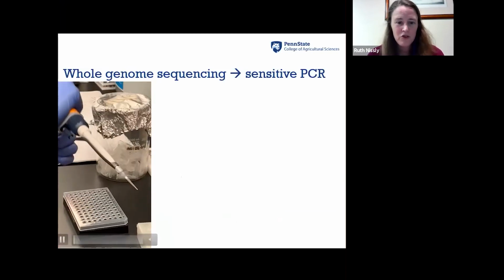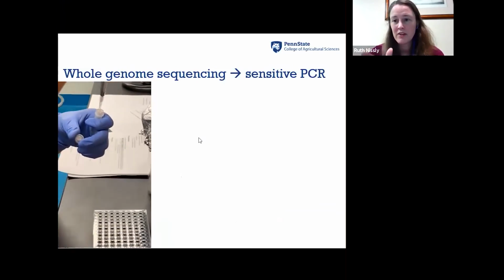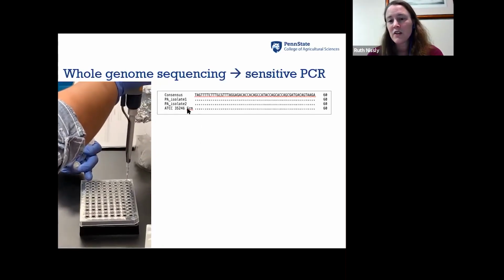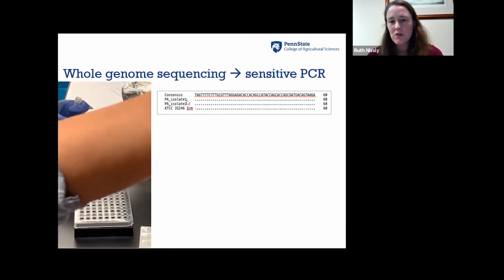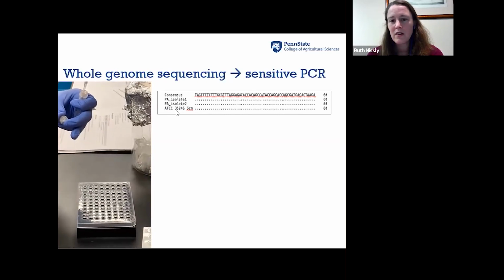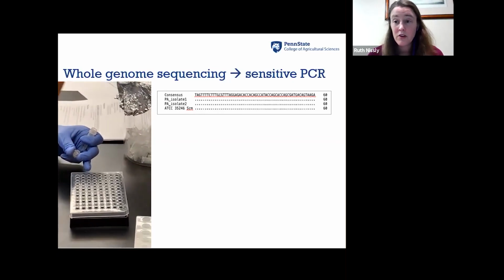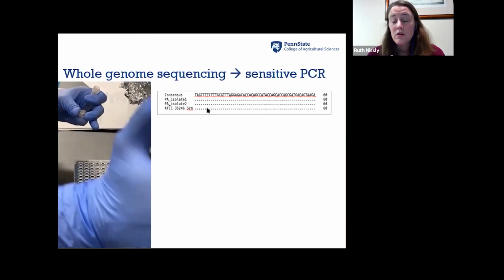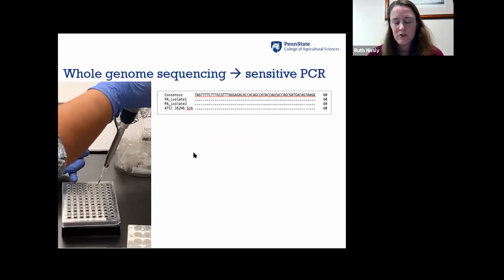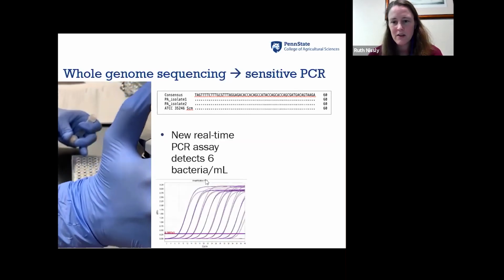We therefore turned to whole genome sequencing to see if there was something specific in the genome that could help us to identify that. And thankfully, we found that there was a specific gene called SZM, which was identical in our Pennsylvania strains to the same gene that had been found in virulent strains from other countries. This was an important finding because it was also not found in the good bacteria. So other strains of strep zoo didn't have it.